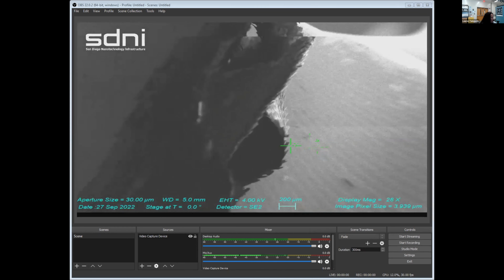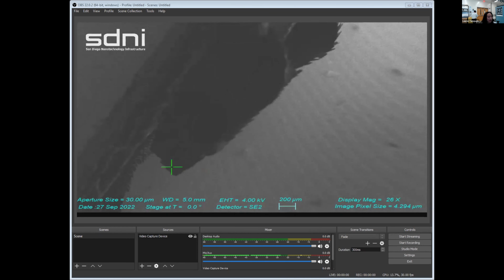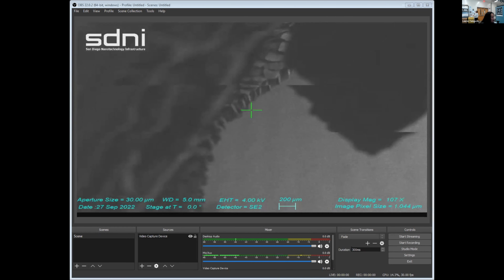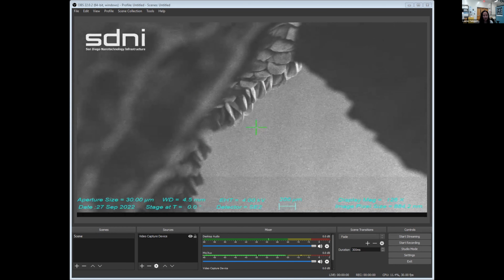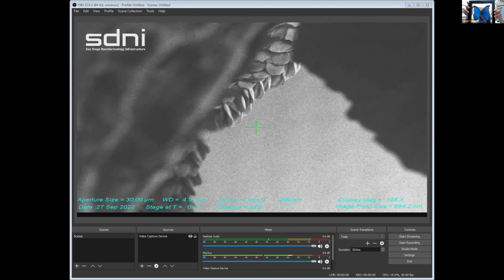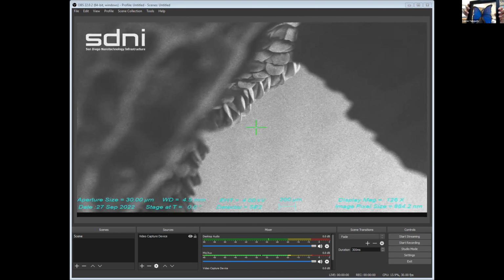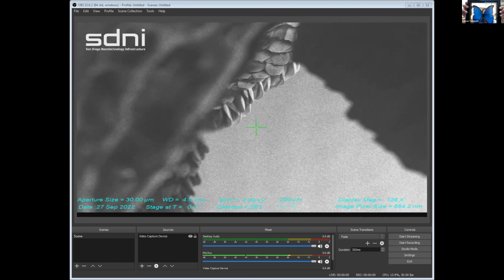Let's see, I'm going to try to find a good spot on here. So this is a blue morpho butterfly wing. Oh, I think this is a better spot. I'm sure a lot of us haven't actually seen a blue morpho butterfly in person, but we have a picture, I think it's an actual one that someone glued to a photo frame, but this is what they look like. As you change the perspective from which you're looking at it, the color appears to glimmer in the light.